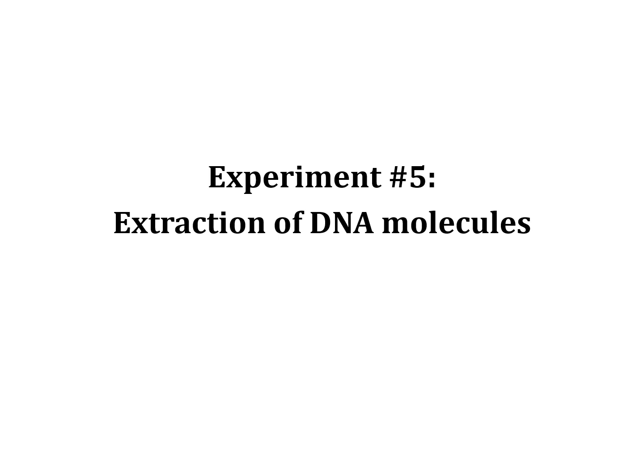Hello, everyone. So today we're moving on to talk about experiment number 5, which is titled Extraction of DNA Molecules. What we're going to be doing today is learning how to extract DNA molecules from cells, specifically nucleated cells. We're going to take blood and isolate DNA from blood. And as you know, the DNA will come from white blood cells, which are the only nucleated cells in the blood. To do that, we have to break the cell membrane open, and we also have to break the nuclear envelope.